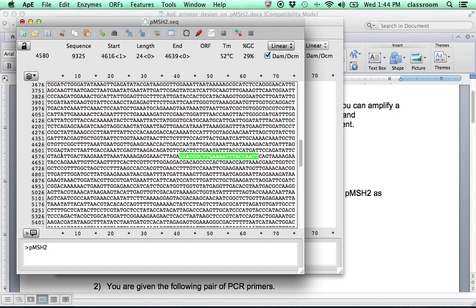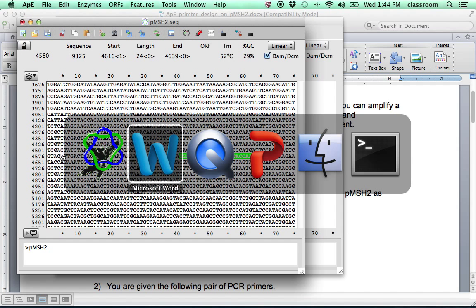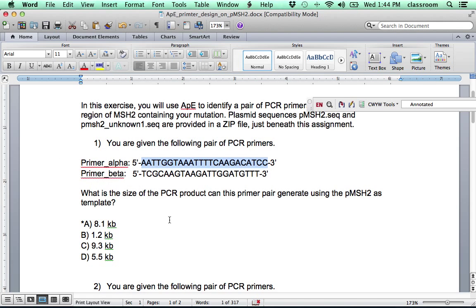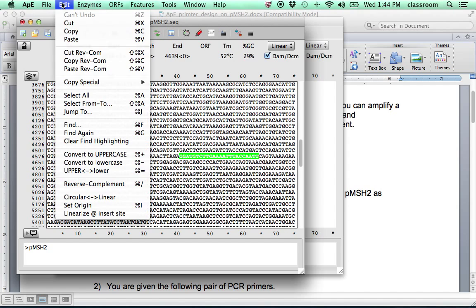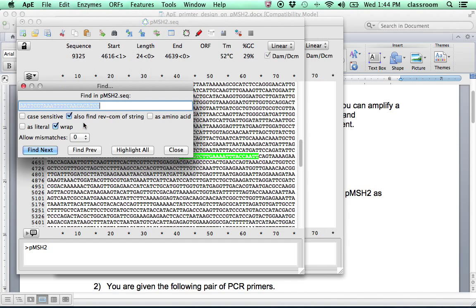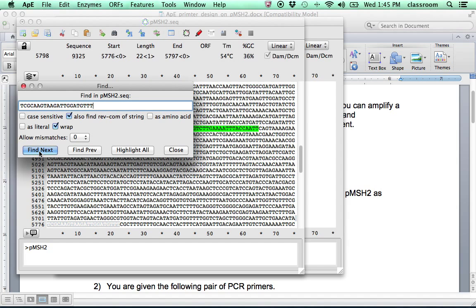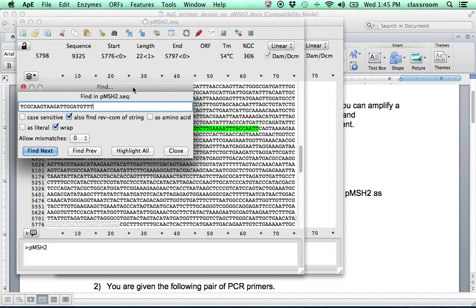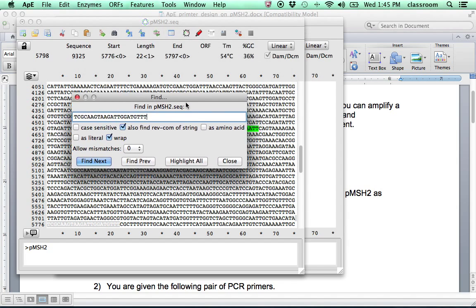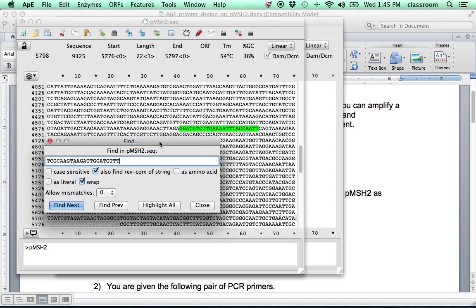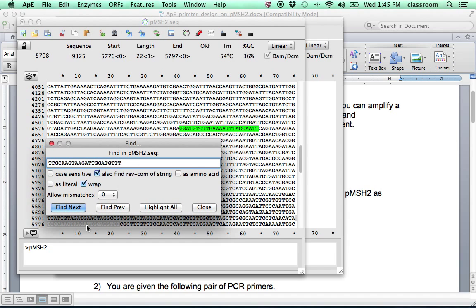And then we find the second primer, this primer beta. Highlight, copy, go back to APE. Edit, find, paste, find next. OK. The sequence now is here. TC, GC, the way to TDT.